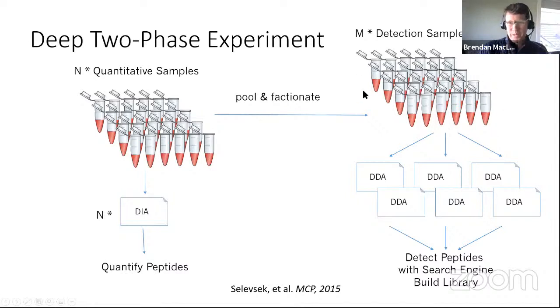There are also papers published about how large scale fractionation, up to the point of doing 40 runs on the same fractionated sample, has real problems with error rates.